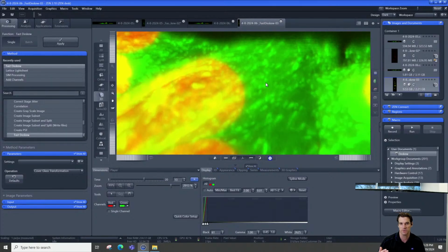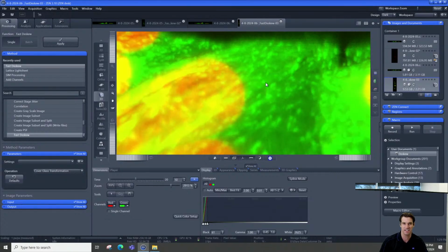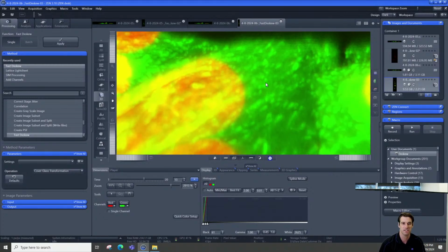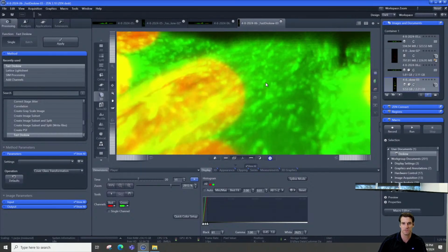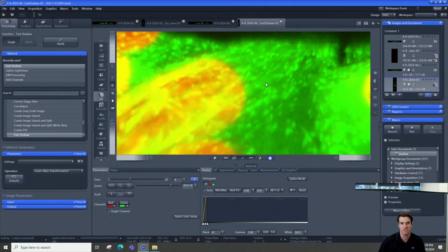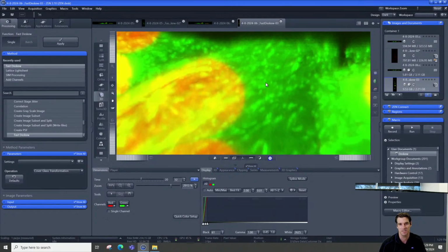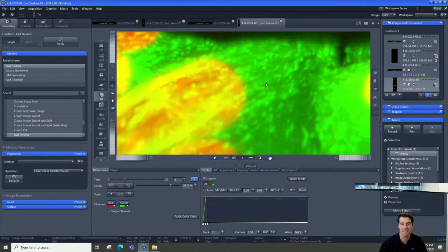And you can really reach deep into those samples and replace those timely Z-stacks and damaging Z-stacks that you used to have to take on your confocal or your spinning disk, and replace it with a single scan that's very gentle. And on top of being very gentle, it's very fast, and going from hundreds of scans to one means that you can also turn up your laser power. You're getting higher signal to noise, so you're getting better data, isotropic voxels, and you're still able to go faster and be gentler. So I hope that that's a good quick demo of the lattice light sheet.